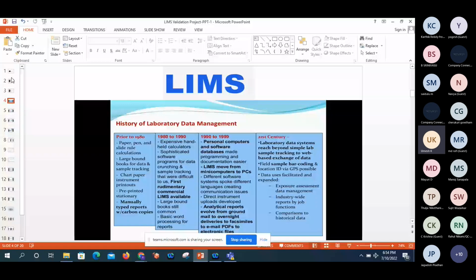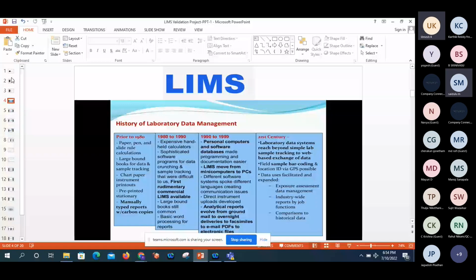You are explaining all of this related to operating procedures. Nowadays we are using LIMS, analyzing these things, and masters also. So in CSV, what are you going to perform, what are you going to tell us? You told us these are related only to masters and analysis procedure. Are you telling us about lot management work?